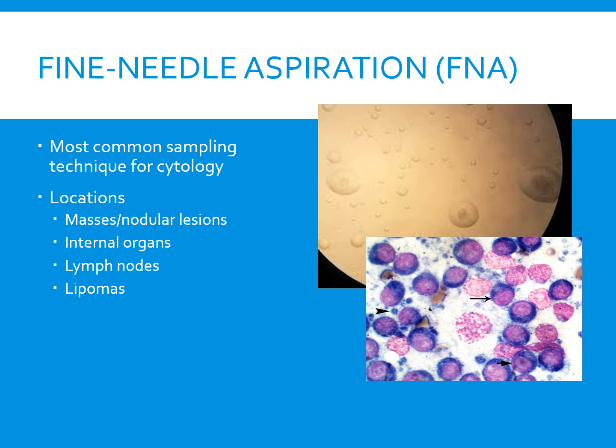For cutaneous lesions, they provide an advantage over other methods because they avoid superficial contamination from bacteria and cells. However, fewer cells are usually collected than with other methods, such as scrapings. Fine needle aspiration can be performed by either an aspiration or a non-aspiration method, which we'll talk about in the next couple slides.